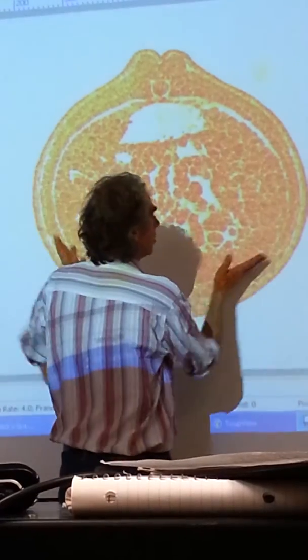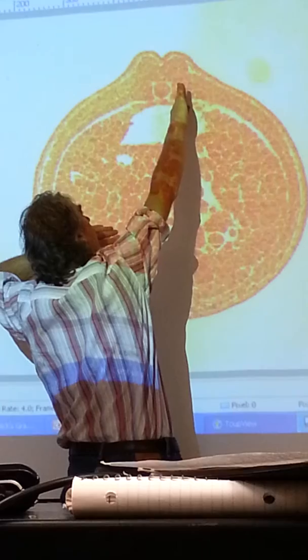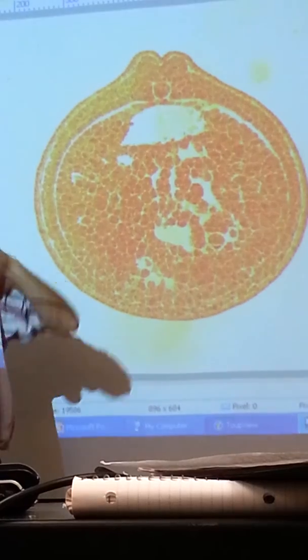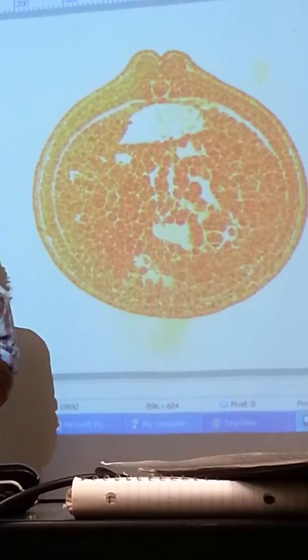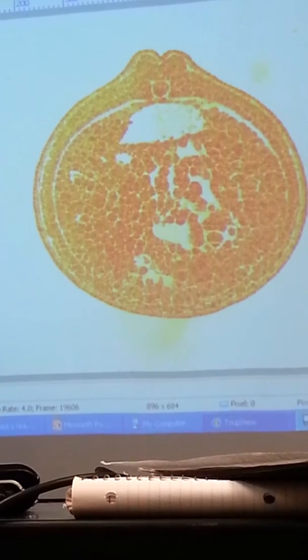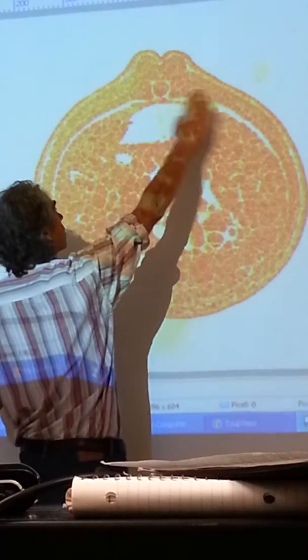The mesoderm has migrated up inward here, and a little bit of mesoderm broke off from this side, and a little mesoderm has broken off from this side and made this. Now remember, what you're looking at is a whole ball of cells. This is what's hardest about this exercise, is you've got to do this mental calculus and see this in 3 dimensions. So you're looking through a slice here.